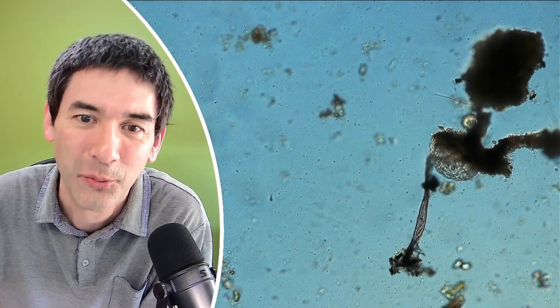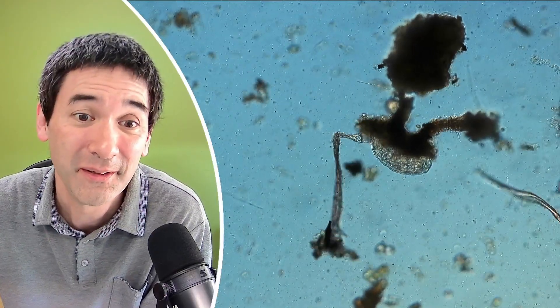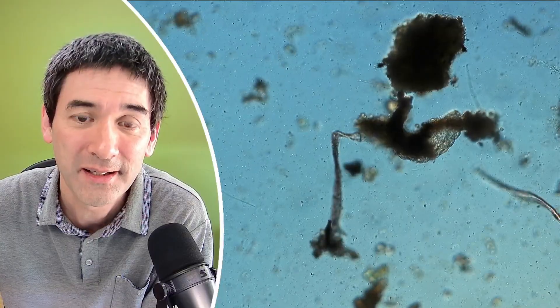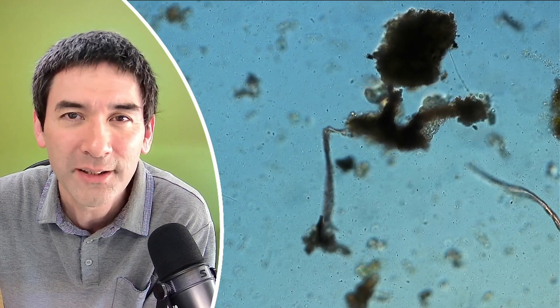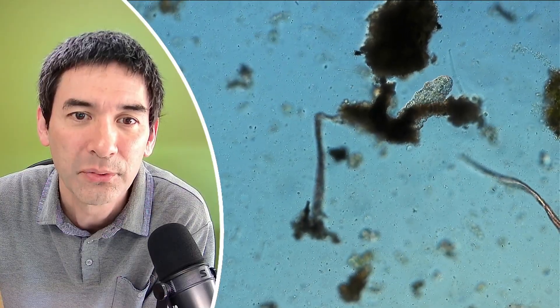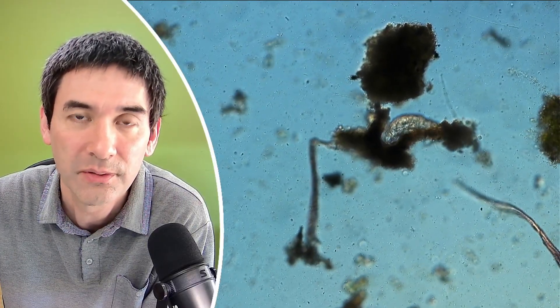What is this one over here? This is a weird thing — what could that be? Let's increase the magnification a bit. Many of you already know what this is — this is of course a water bear, a tardigrade! There are lots of them in here. A few days ago when I first put it under the microscope I also immediately found one. One of the disadvantages concerning tardigrades is that they like to cling to objects like debris, so sometimes they're covered up a little bit.